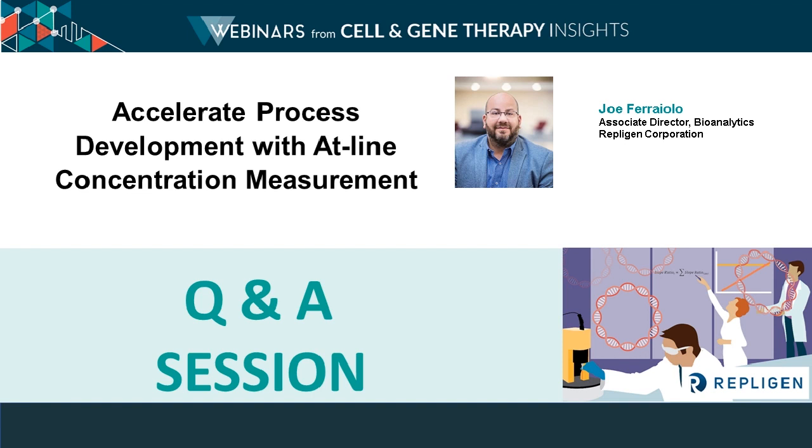Brilliant, thank you. And can the SoloVPE be used to test incoming plasmid product as raw material to check purity levels? Short answer is yes. Again, our approach is that it has to be purified material. So we are not looking at anything from the harvest. It has to be purified.